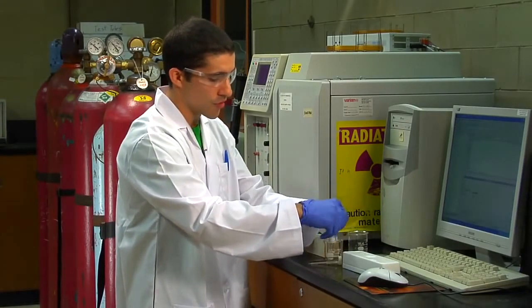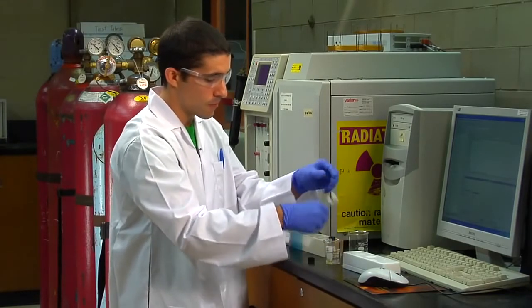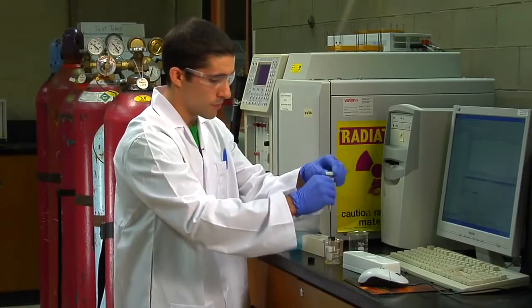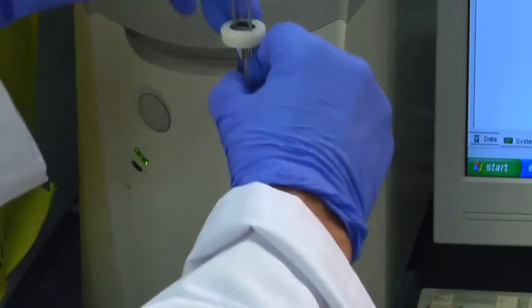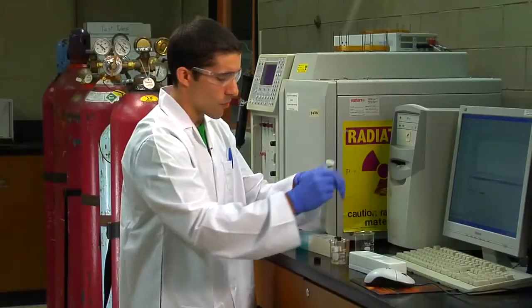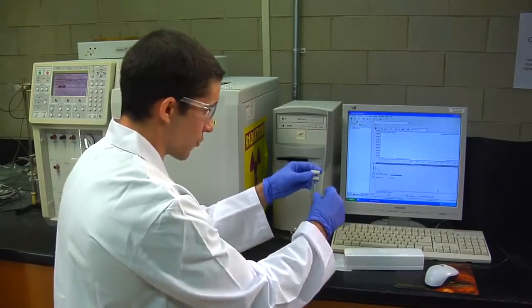Once you clean with the wash solvent, you can just do a few rinsings with the sample. And when the syringe is sufficiently cleaned, you're now ready to take in your sample.